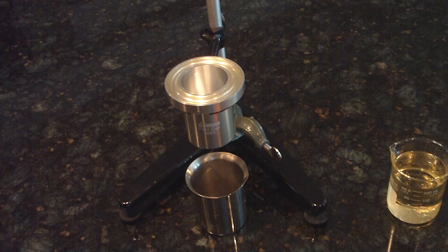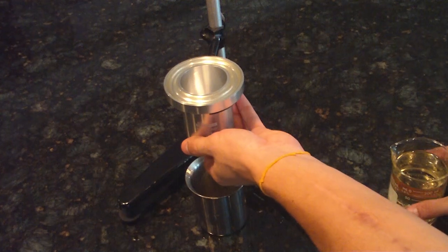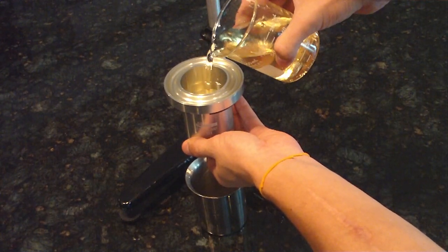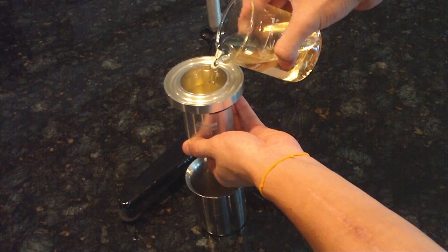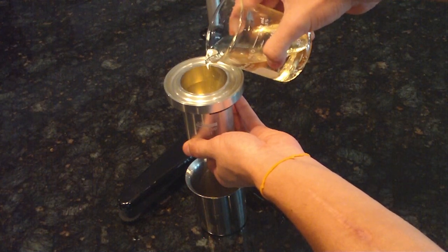First, you place the Ford cup in the holder, plug the hole at the bottom, and pour your liquid in to the top until it's overflowing.